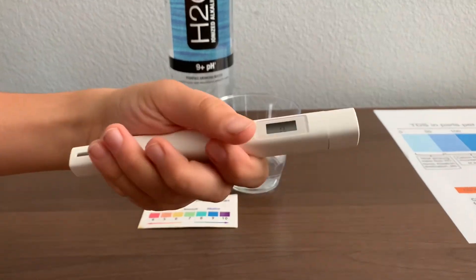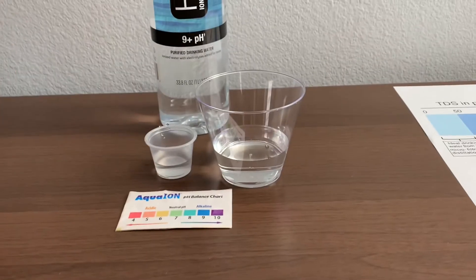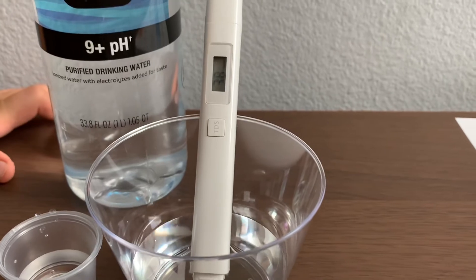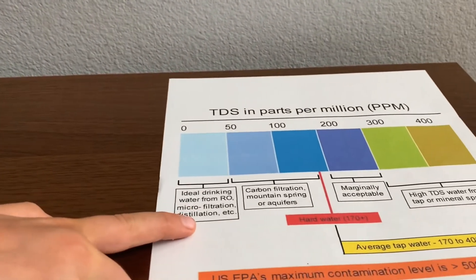Turn on the TDS tester. Make sure it says 0 and put it in. 38. That is microfilter distilled water.